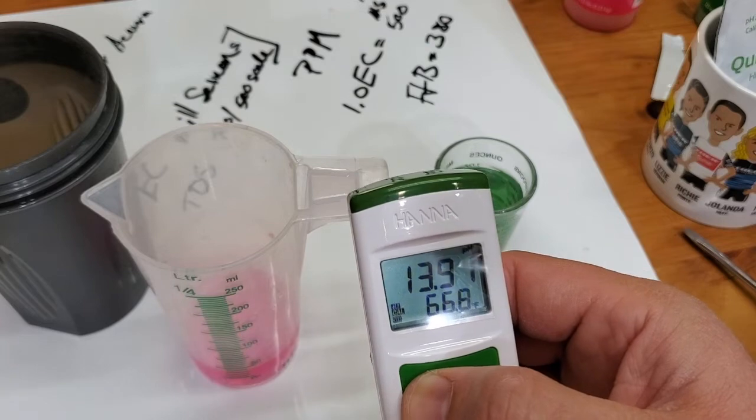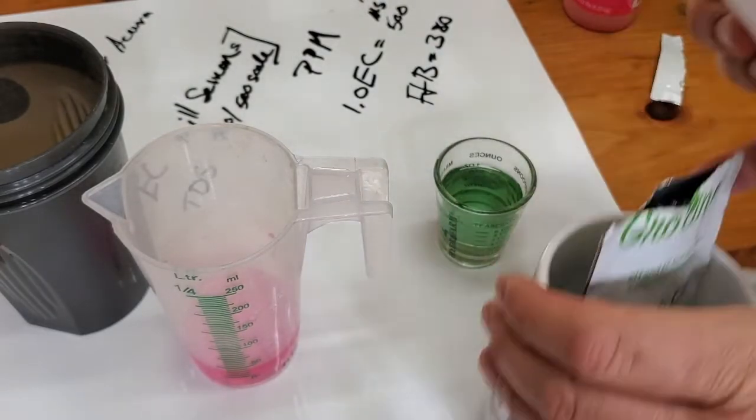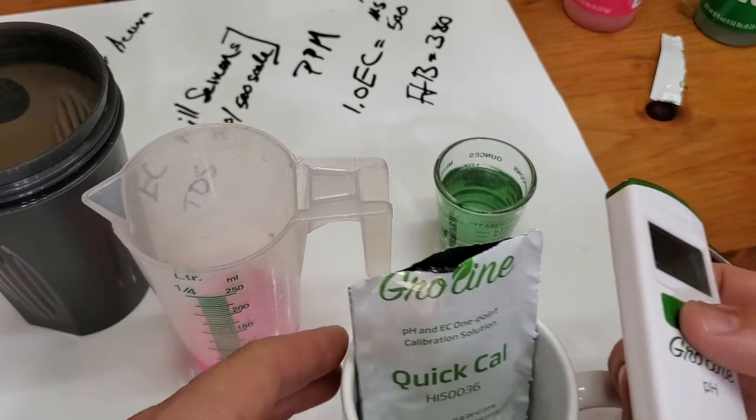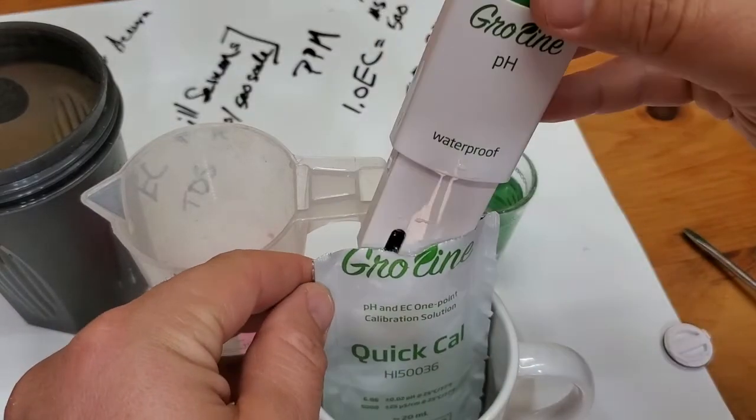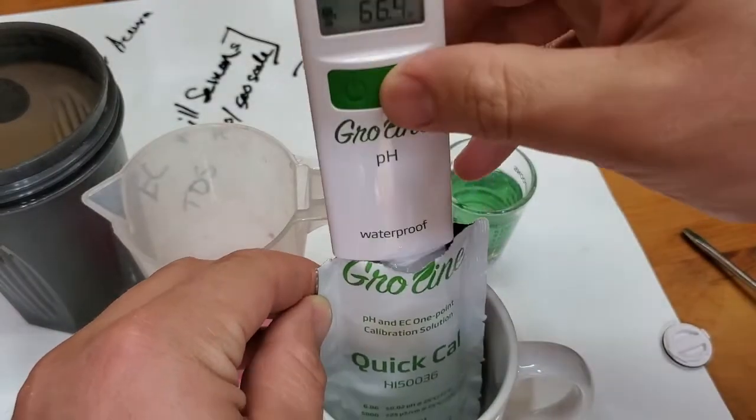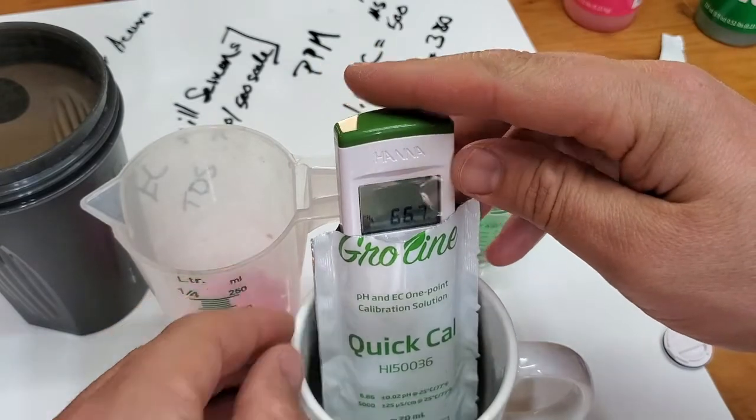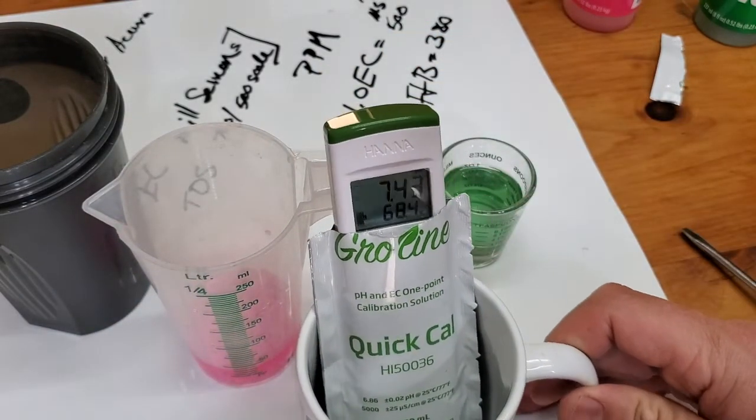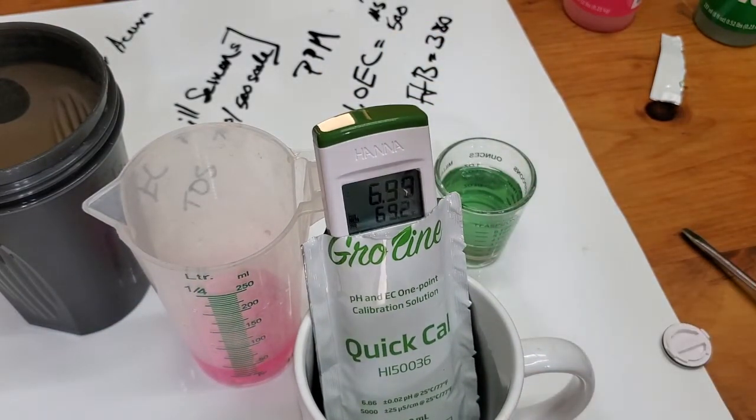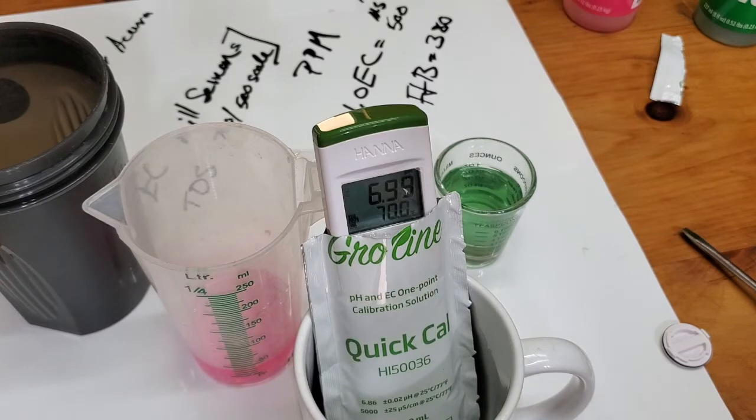Back into our Quick Cal solution, let it run its cycle. Once it's done, it'll be quickly calibrated. So that's both ways to calibrate the Hanna Grow Line 9811-8.